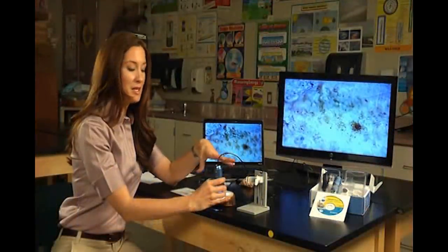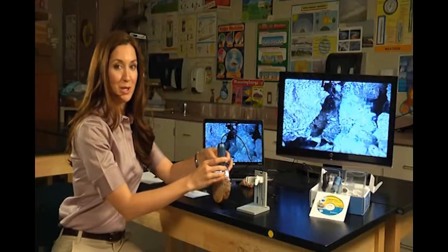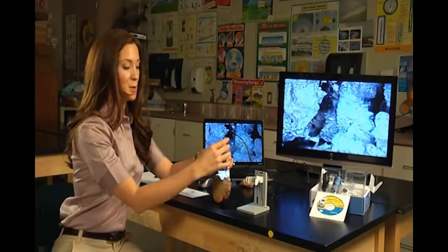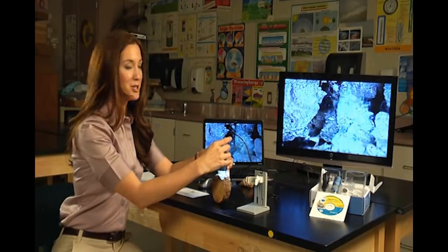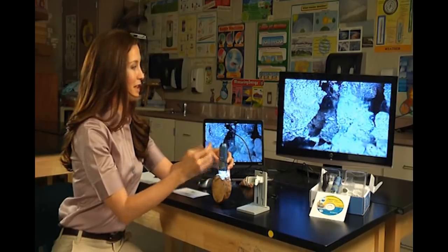But what's great about the SmartScope 5M is you're not limited to just this side like you are with the slide. You can actually pick up the object and turn it around and look inside there. You can actually see inside the crevices of the bark. You'd never be able to do this with a traditional microscope. And with the SmartScope 5M, you can take great pictures. So I'm just going to press the photo button right there at the top to capture that image.